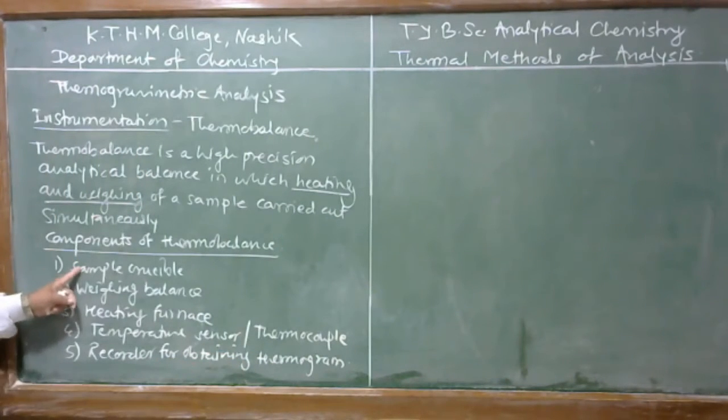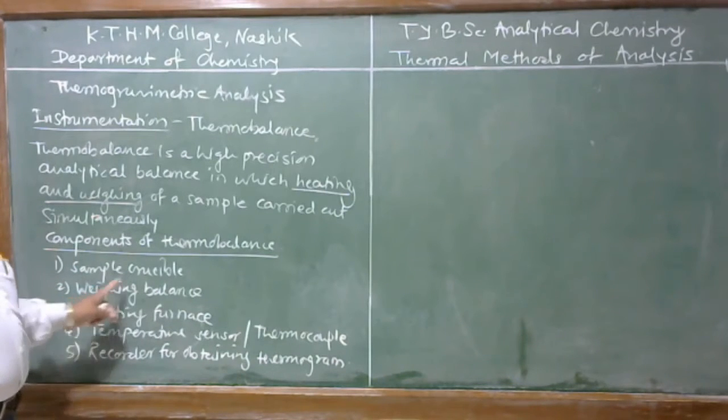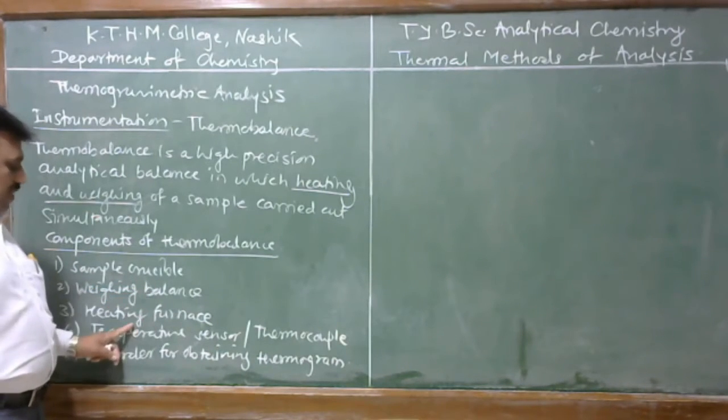These are the requirements for the construction of a thermobalance.